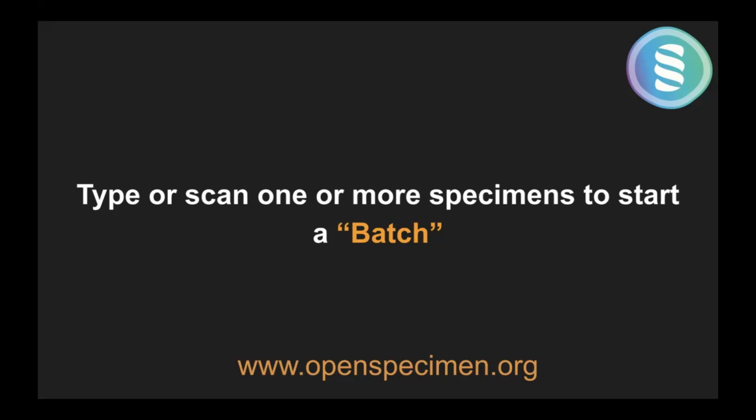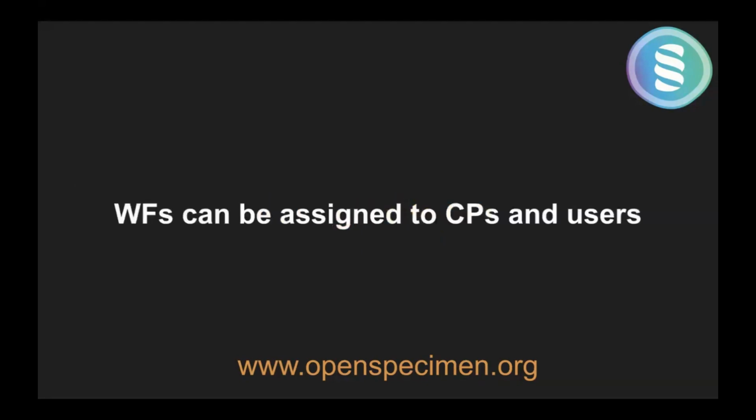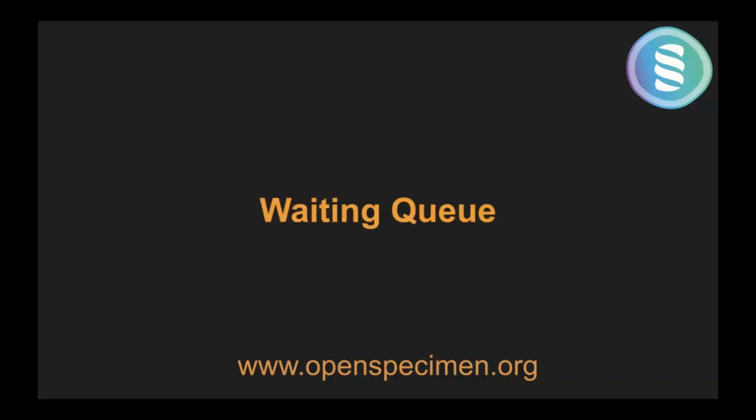But typically, more or less, 80-90% of the workflows that we develop are specimen-based workflows. That's why most of our language, the PPTs and the wiki pages, talk about the specimen being the starting point. Same thing about access controls. Workflows can be assigned to CPs or users. That way, you only see your workflows. I think there is a bug recently, but in general, the idea is that people should see only the workflows assigned to their CPs and things like that.